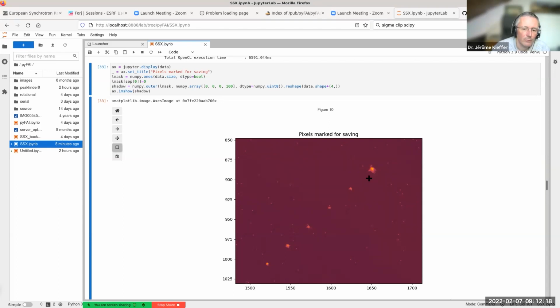Sorry, it's not just actually dark subtraction, it's also like gain multiplication, right? It's Jungfrau, yes, with 3 gains, absolutely. Okay, but when I say pedestal correction, it's the complete pedestal correction with the 3 gains and so forth. Did you estimate how much all this processing, like image assembly plus all those corrections, take?